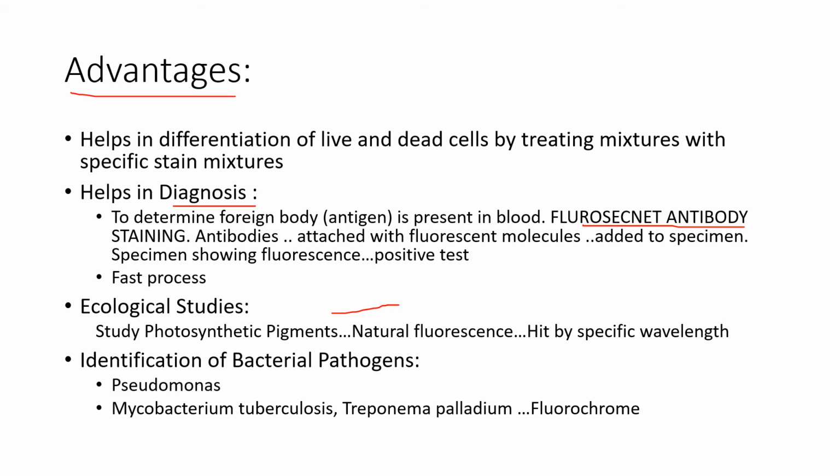These all are fluorochrome stained. And then finally, when we see them under the microscope, we get to see their better image, better morphology, better detailing, zooming in, even better images. So that's how we will be identifying the bacterial pathogens.